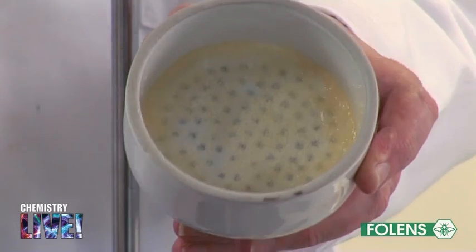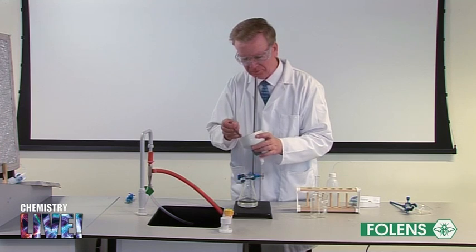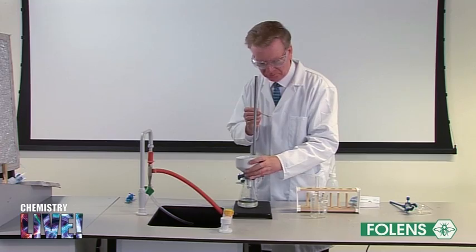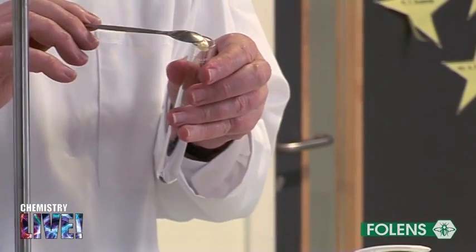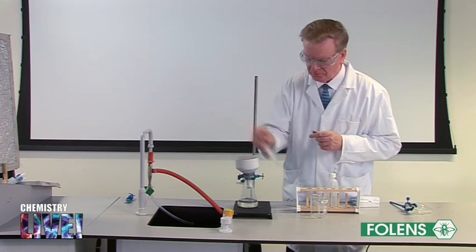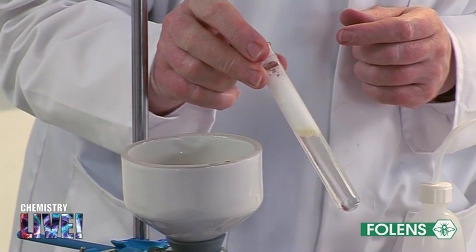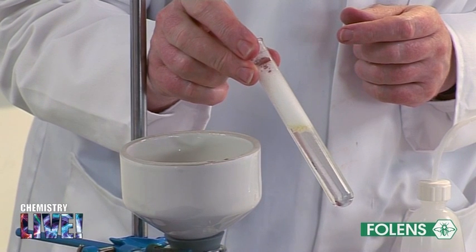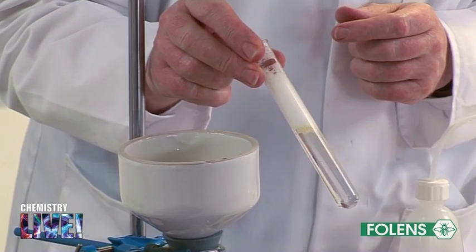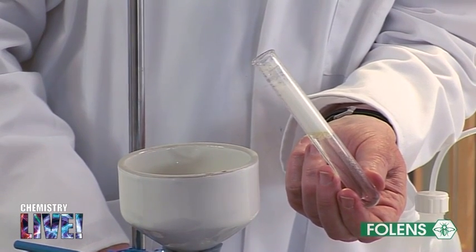Using a spatula, take a sample of soap and add it to about half a test tube of deionised water. Shake the test tube. We observe the characteristic lather of soap. The soap you have made looks different from the soap you buy in a shop. This is because when soap is made commercially, other ingredients like perfumes and colouring agents are added to make it more attractive.